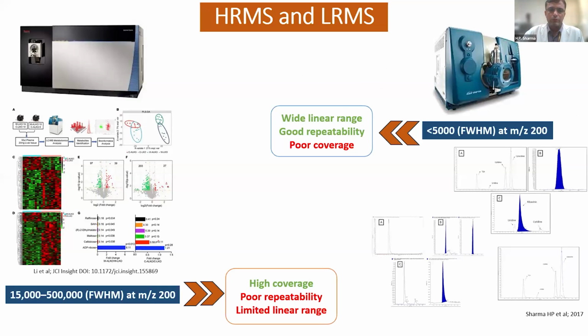So to put it in a nutshell, if you are allowing molecules to run a marathon, then from the molecular weight difference, you will be able to get a quite good separation between molecules having quite near molecular weights. And this is the comparison slide between the high resolution mass spec at the left side and the low resolution mass spec at the right side.